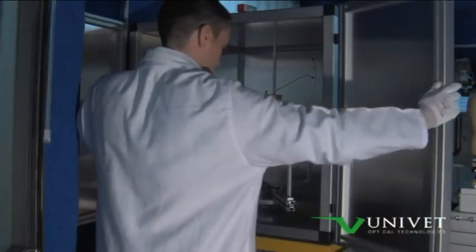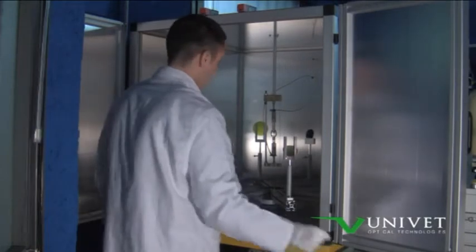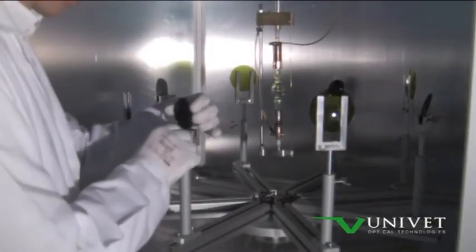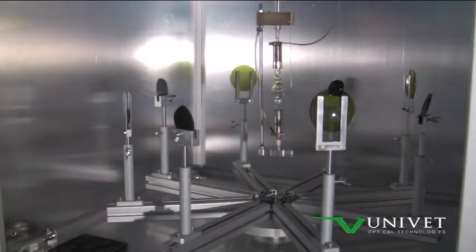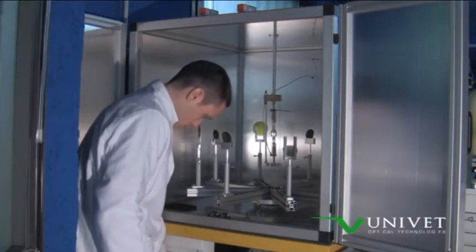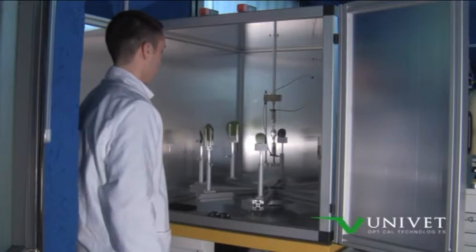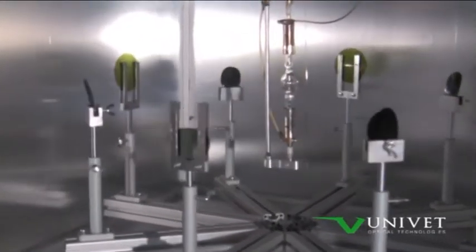The artificial aging test is used to study the behavior of the eyewear, following a long-term use by simulating the accelerated aging process suffered from a PPE during its life cycle. The eyewear is inserted in a chamber and exposed for 50 hours to the light of an ultraviolet lamp with a power of 500 watts.